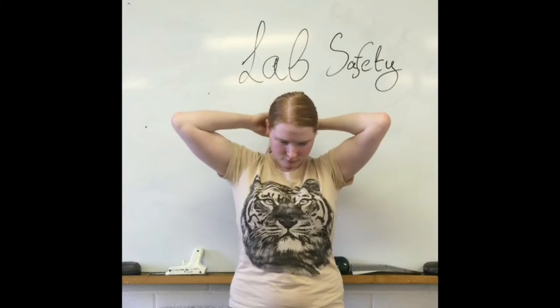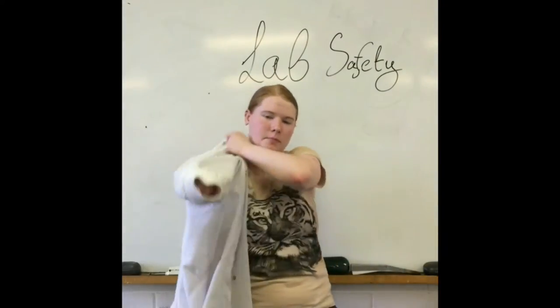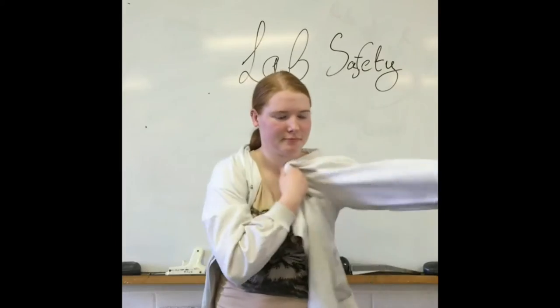It is important to tie back your hair in the lab. You must wear a lab coat and all safety equipment.